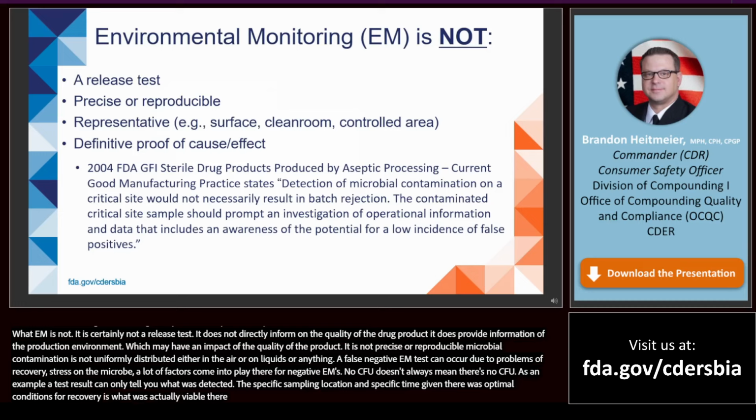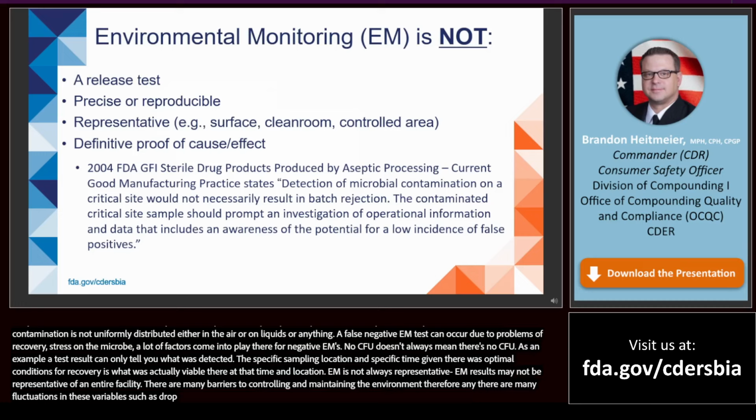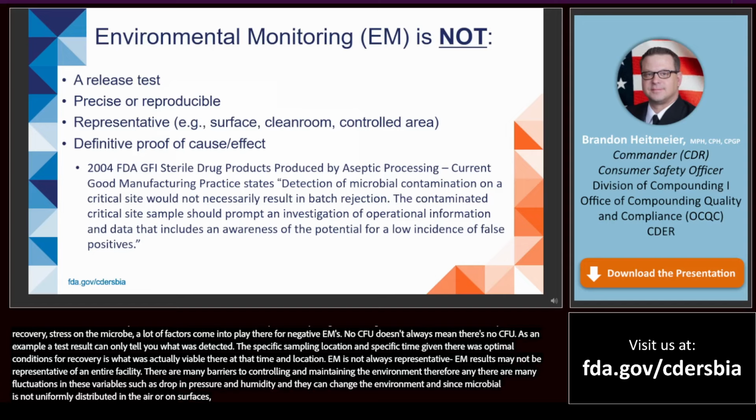EM is not always representative. EM results may not be representative of an entire facility, of course. There are many variables controlling and maintaining the environment in a controlled area. Therefore, any localized fluctuations in these variables, such as a drop in differential pressure or humidity, can change the environment. And since microbial contamination is not uniformly distributed in the air or on surfaces or anywhere else, detection of microbial growth or lack thereof in one area of the controlled area does not represent the entire facility.